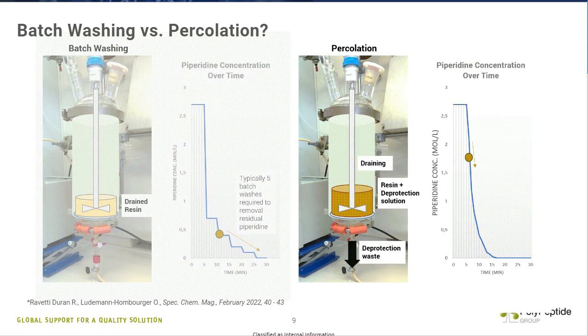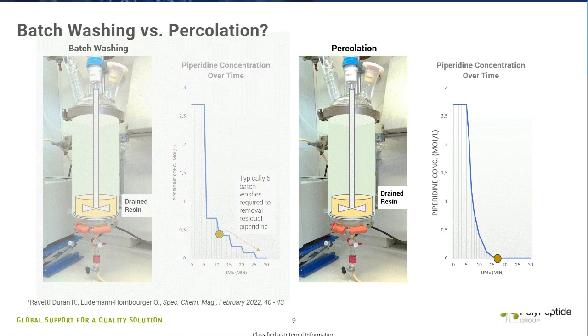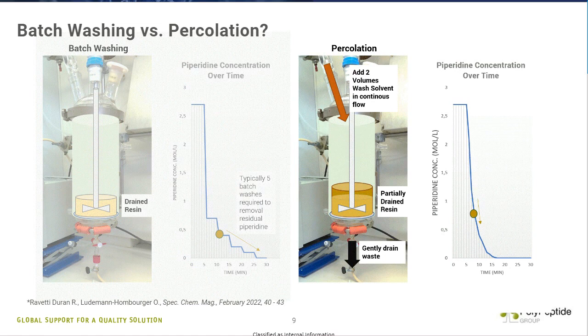But if you have maybe a peptide with a complex structure, or where there's very strong possibilities of forming difficult impurities, then there may need to be another iteration in between before we go to a GMP batch, and this will have an impact on your overall timeline. So this is something to consider, and of course this is also something that we discuss with the client before ever embarking on a GMP campaign.